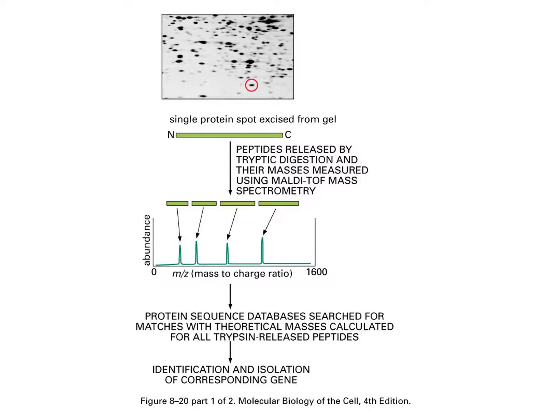And virulent means how high level, if something's virulent, it's high level to infect and potentially kill. So all this information is coming up right now in the databases. So every causative agent can be analyzed, as well as every cancer from every patient. All that data is coming together.